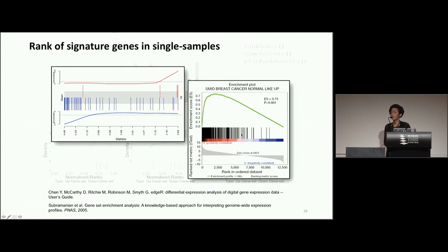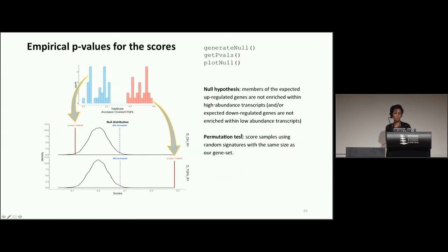But what we do is provide single-sample visualization, where we look at the rank of the genes within each individual sample. I also forgot to mention that these can all be interactive, so you can hover over those ranks and see which genes perform better than other genes in the data.